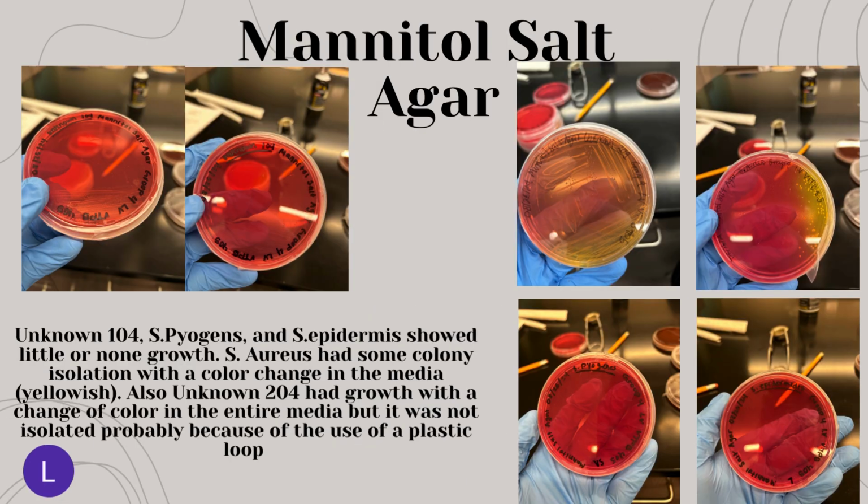On this slide, I would be talking about the mannitol salt agar, which in this case we can see that unknown 104, S. pyogenes and S. epidermidis show little or no growth. By that, I want to point out that both of the pictures on the top left are from unknown 104 from different angles, and you can see some slight streaks that we had on that area. It showed some growth but kind of transparent.